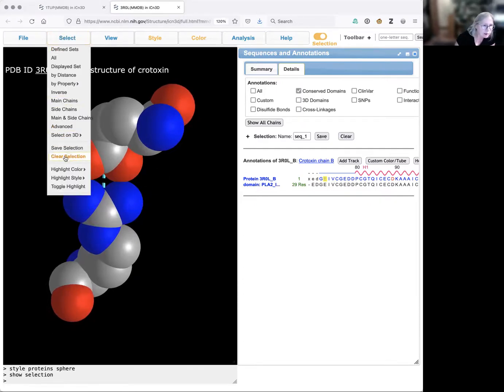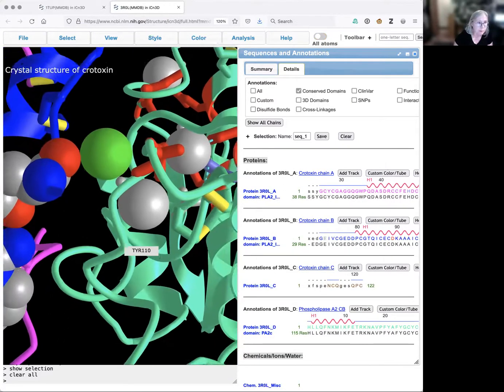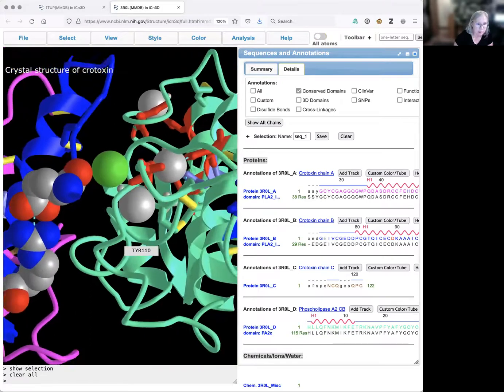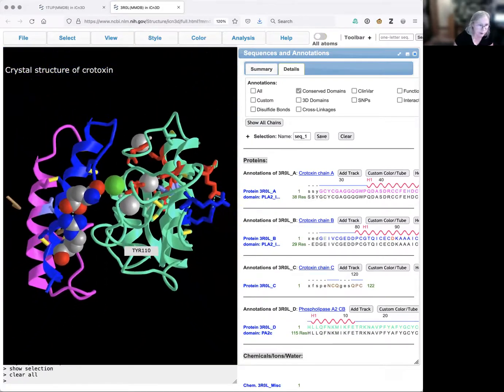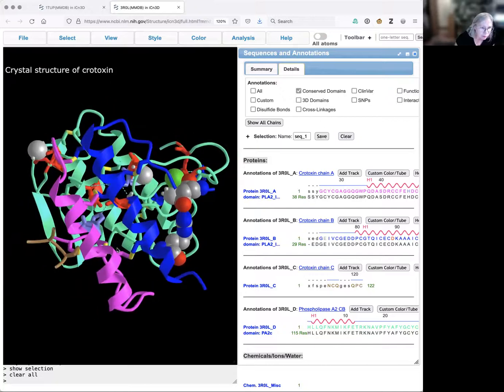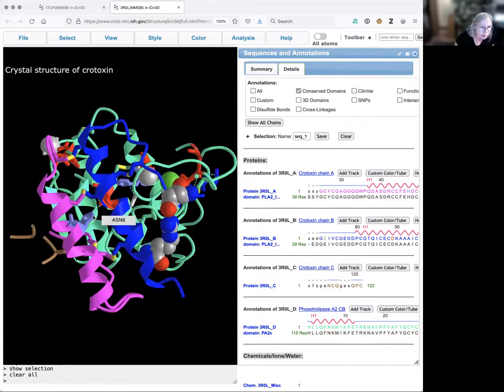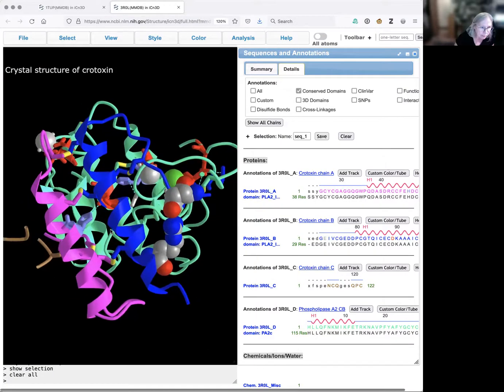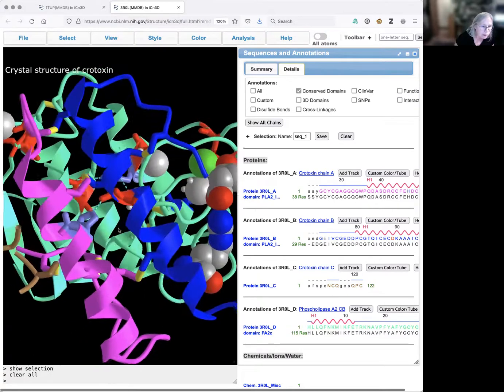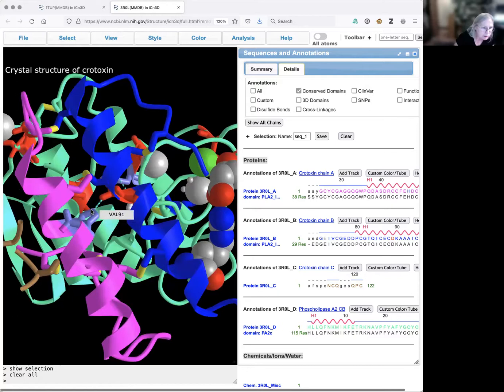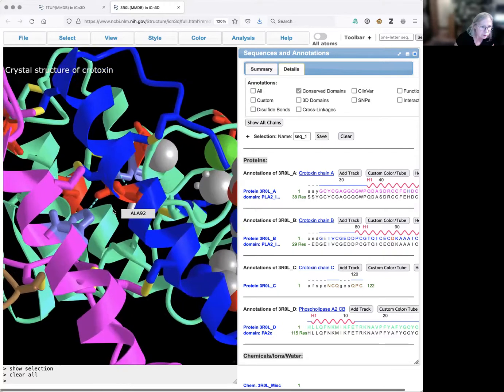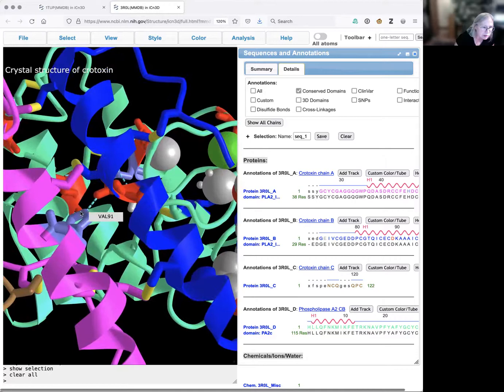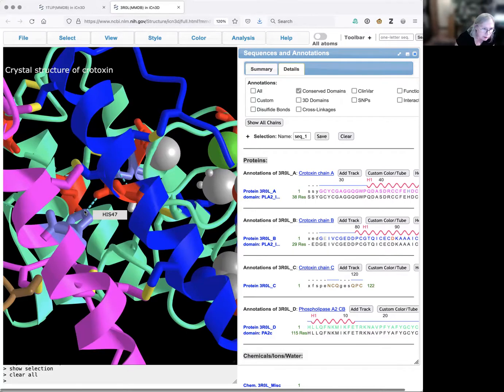If we go back now and say clear selection and look at our entire protein, we can see some other examples of ionic bonds as well. Here's one where there's a histidine. Now I see it's histidine 47 and that's interacting with aspartic acid.